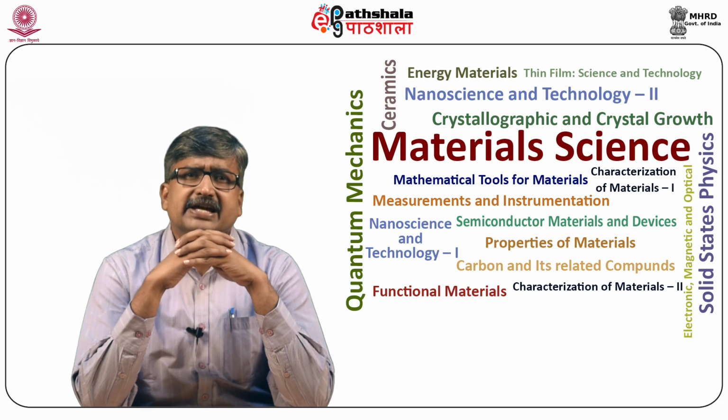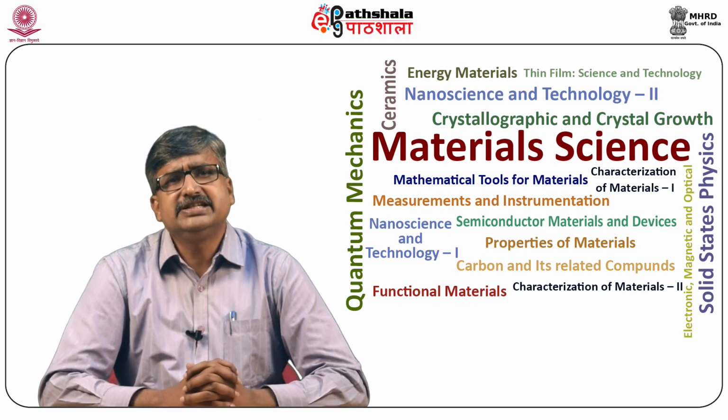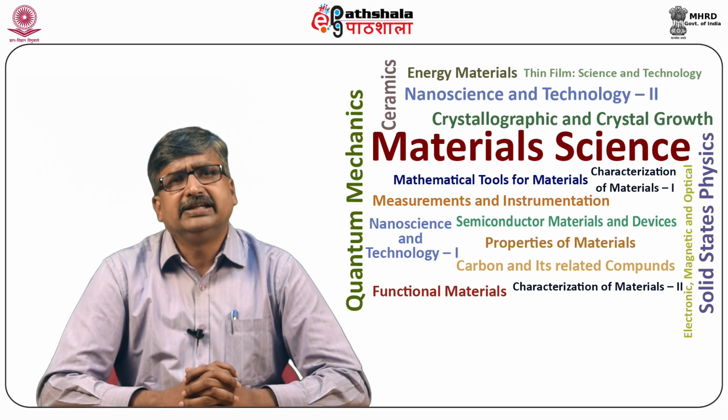CE displays enormous efficiency and possesses inherent advantages over conventional separation techniques. Fluorescence detection for CE commonly employs a laser as an excitation source. Lasers emit intense radiation with extremely narrow bandwidth, high spatial coherence, and negligible chromatic aberration. Their output is easily focused on the small flow channel of the capillary.